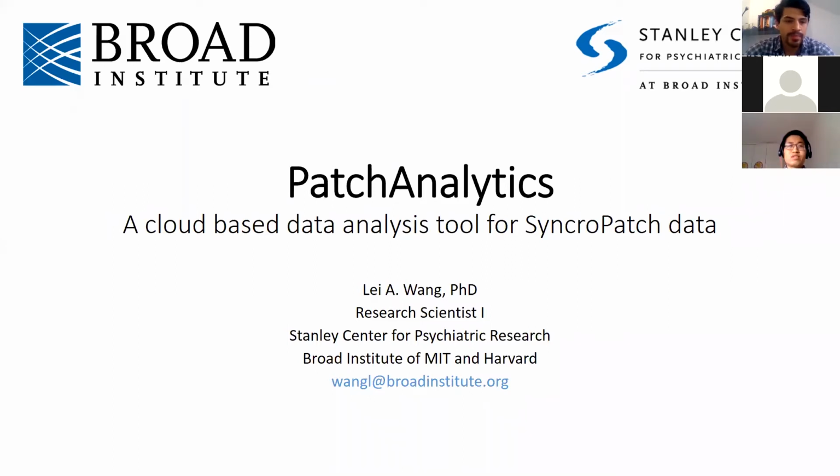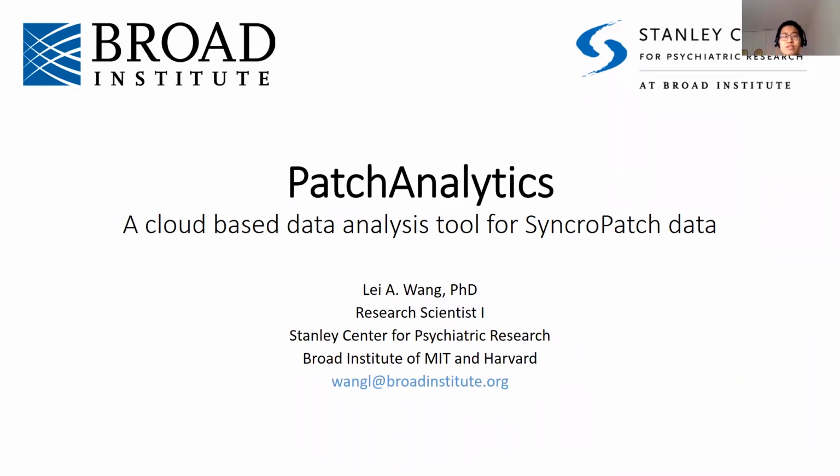Okay, so first I want to thank Nanion for inviting us and giving us this opportunity to share a tool we have developed over the past few years. We have been using the SynchroPatch system for drug discovery and also for analyzing genetic variants of ion channels. Based on our experience, we have realized the bottleneck of the SynchroPatch system is usually data analysis. So that's why we decided to develop this software, trying to automate the data analysis.